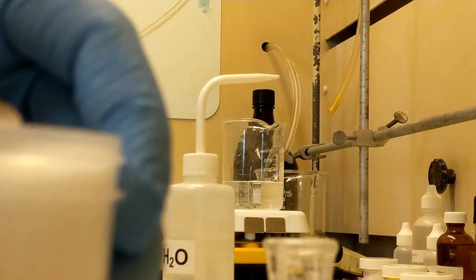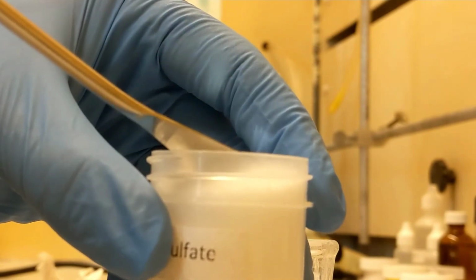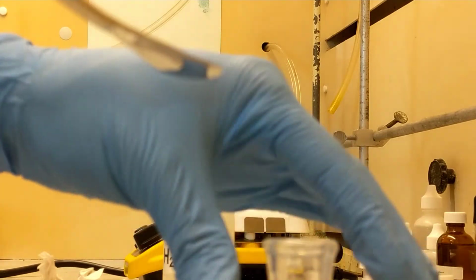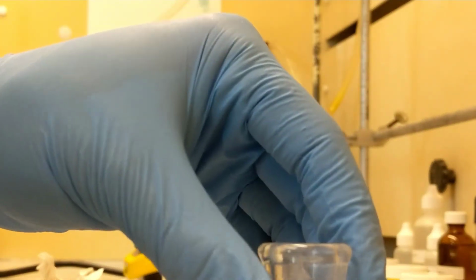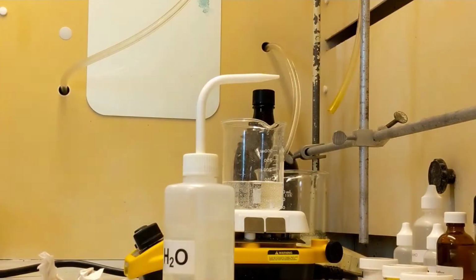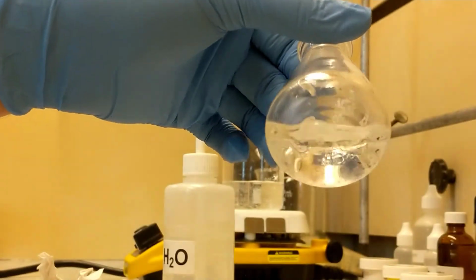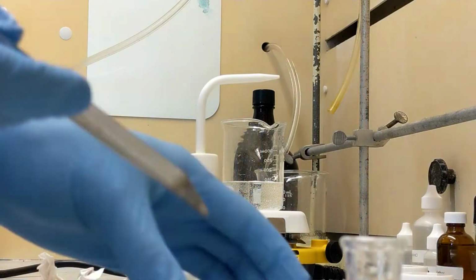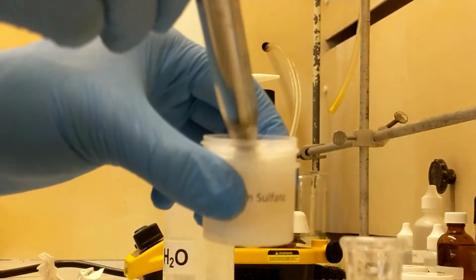So I'm just going to add a little bit of this at a time. See, I'm just going to scoop maybe that much. Okay, and I'm just going to add it into my Erlenmeyer flask. You see it at the bottom? So you see how it's clumping there at the bottom? Here we go, this is what we really needed. A nice scoopula. Yeah, that should be good.